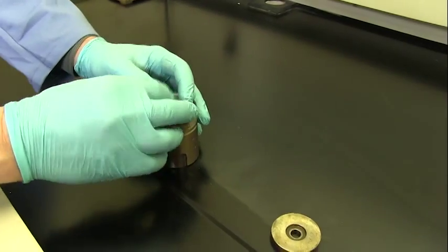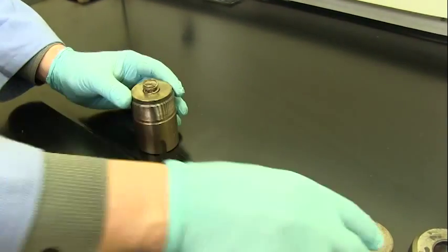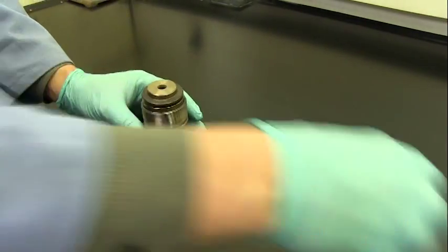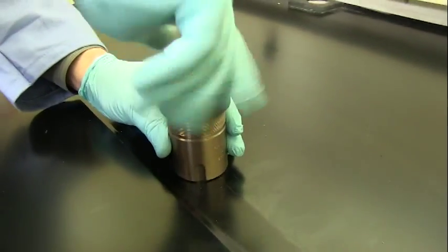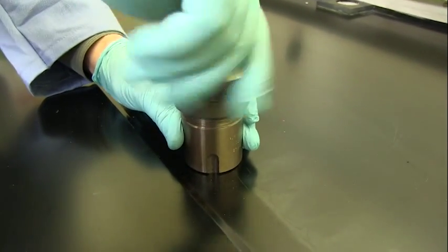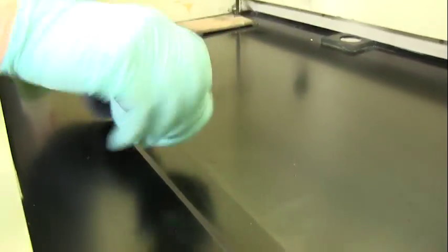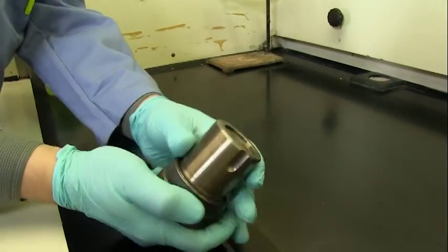Not all pressure vessels use a PTFE insert. Internal wetted parts of a pressure vessel have to be constructed resistant to corrosive materials at the expected operating pressure. Each alloy has its own physical strength and temperature characteristics, as well as its own unique resistance to certain corrosive materials. All of these factors must be considered when making a selection.